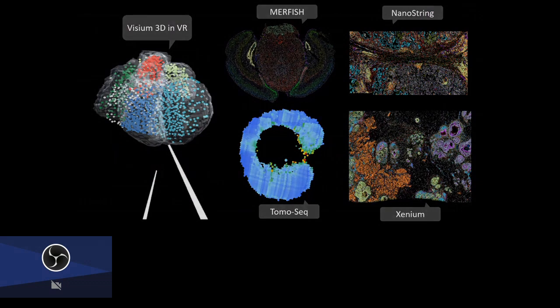And with the last couple of minutes, I just want to quickly go through the experimental design. Because at this stage we have the software, but we are really lacking the three-dimensional data for it, because not many experiments are run. They're starting now, but we don't really have the data to analyze data often in 3D.